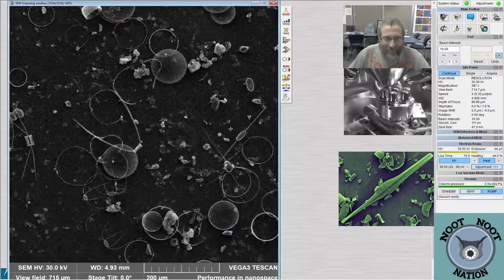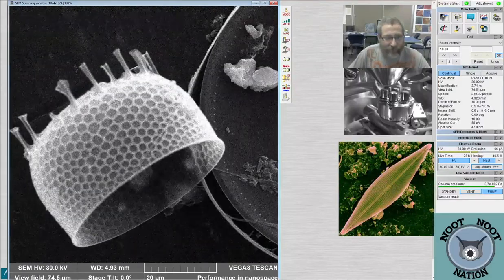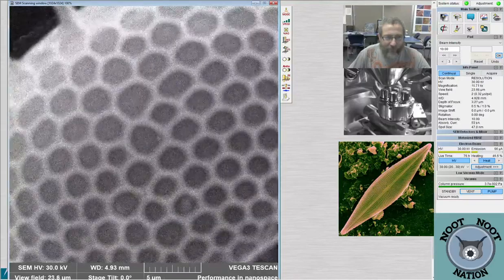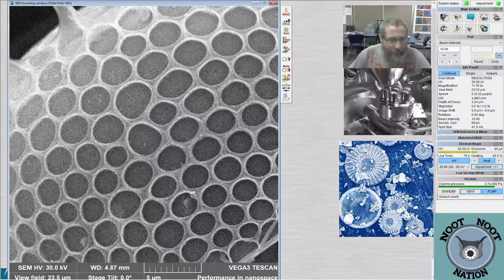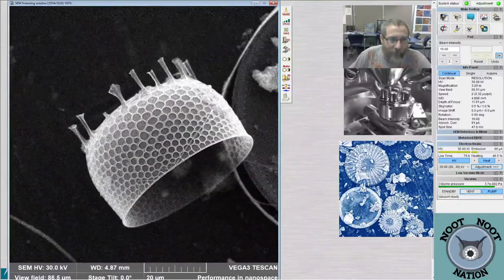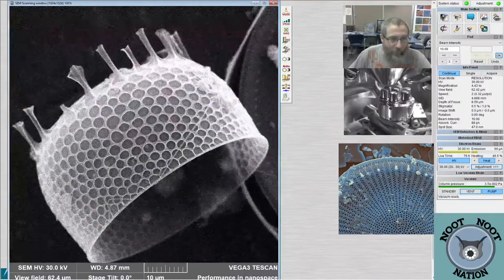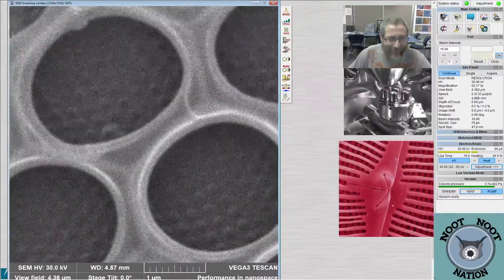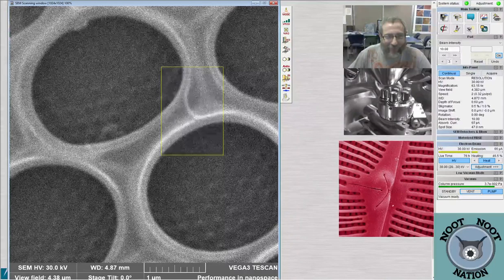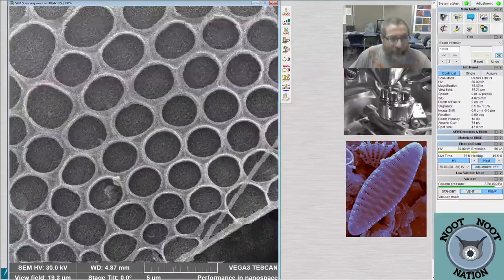Ivan wants to know, how much does the microscope cost? Everybody always wants to know how much your gear costs. Well, they probably want one. Scanning electron microscopes are expensive. This one, which is the Tescan Vega 3, cost about $160,000. I think we got it at a discount because we're a university, and also they knew that we had a couple of different companies interested in selling us a scanning electron microscope, and we let them know that they were in competition with each other. So I think the price they gave us is not one that, even if you were looking for buying one, that you'd likely get.